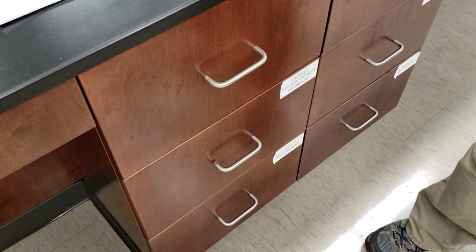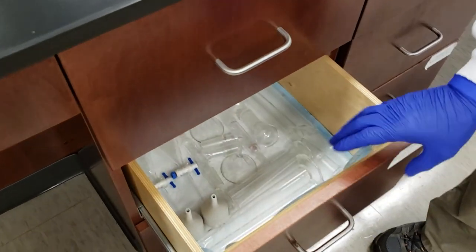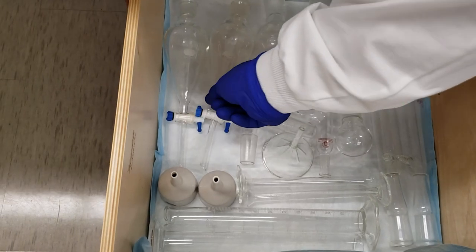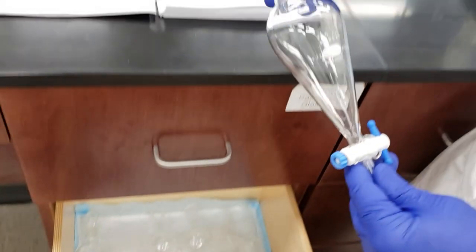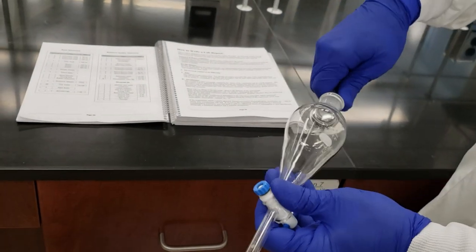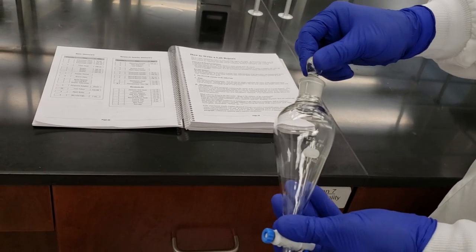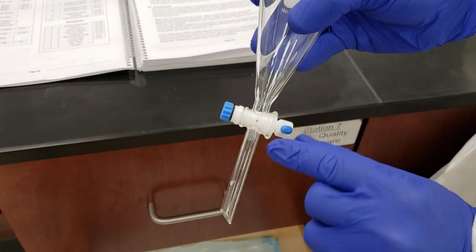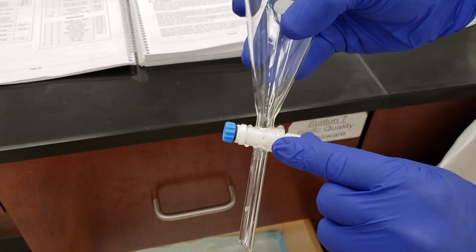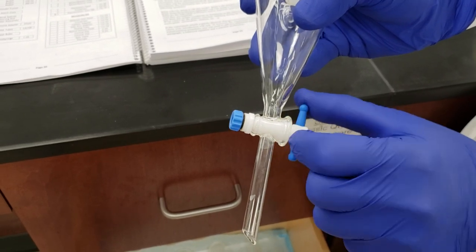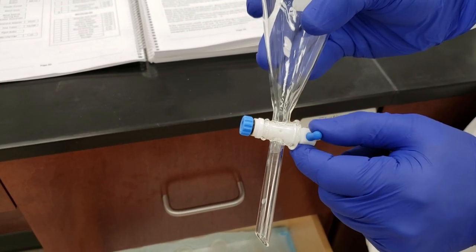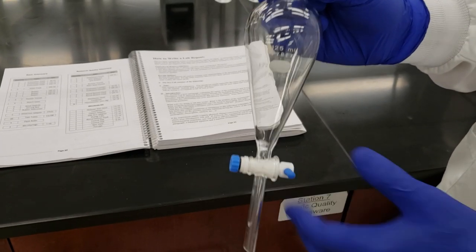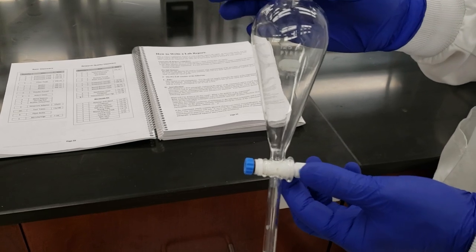Let's take a look at drawer number two, our research quality, higher priced items. We'll start with our separatory funnel which comes in three parts: the stopper for the top, the stopcock with a hole through the center that we rotate to open and close, and the main body. This helps us with extractions and is very expensive, so be very careful with all your glassware.